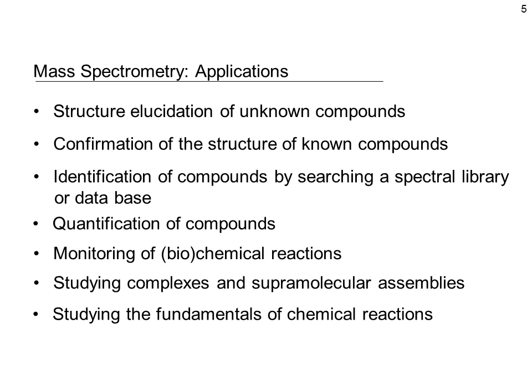This sounds kind of straightforward, but is certainly not easy in bioanalysis, where we are dealing with millions of compounds in one sample, and we would like to analyze just one particular compound, for example a drug or a drug metabolite. However, we know the structure of this drug molecule, and we can thus optimize our mass spectrometric method to focus on this molecule.